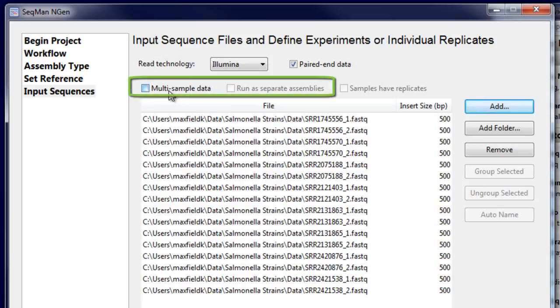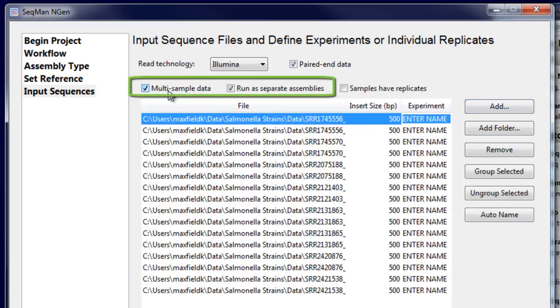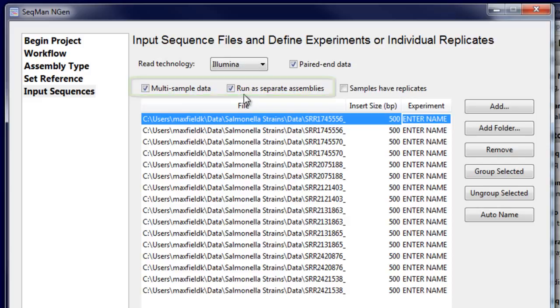I'm going to check multi-sample data, and for most cases, we recommend running multiple samples as separate assemblies.